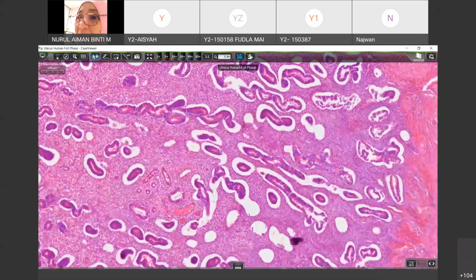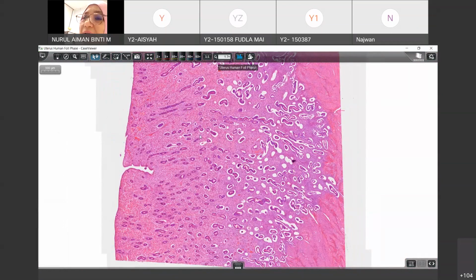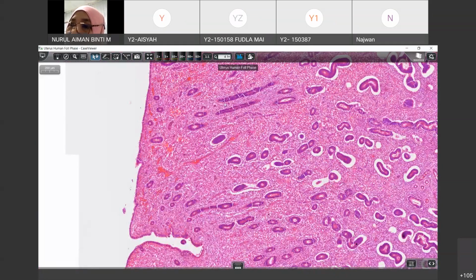So basically, the endometrium contains what? What is this actually? The rounded region contains lumen inside. What is it? Uterine gland. Yes, again, I couldn't hear, Anas. Uterine gland, basal end. Okay, very good. So these are the uterine glands. All glands, you have to understand, must be invaginated epithelium.